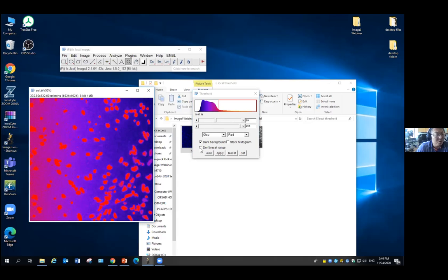Okay. So this problem you cannot fix by using a different algorithm, because no matter what you choose, it still calculates one thresholding value applied to the whole image. Here, what we need to do is generate a thresholding depending on its local environment. So on this part the thresholding should be higher, and on this part it should be lower.